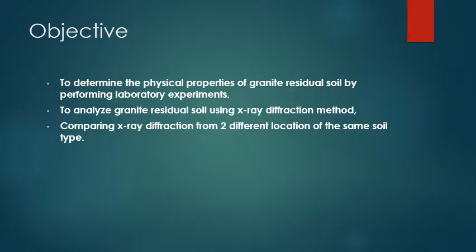The objective of this project is to determine the physical properties of granite residual soil by performing laboratory experiments, to analyze granite residual soil using the X-ray diffraction method, and to compare X-ray diffraction results from two different locations of the same soil type.